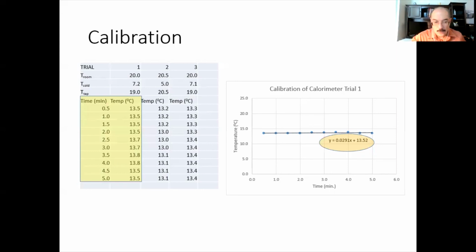To extrapolate so that we can get to the final temperature here. In this case, we are going to use the equation of the line, and we're going to use that value of the intercept there to project this graph over here to what the final temperature would have been after the mixing of water and the exchange with the calorimeter itself.